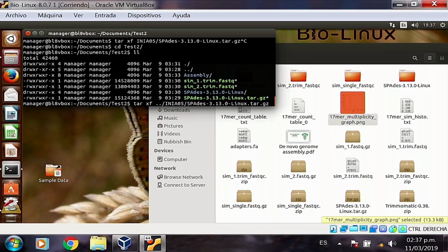But it really doesn't matter. It's neater that way, but don't worry, it's fine like that. It's going to work. Remember, you can use autocomplete to avoid typos. Typos happen all the time. All right, have you all unzipped? Basically, that tar command is to unzip a directory.